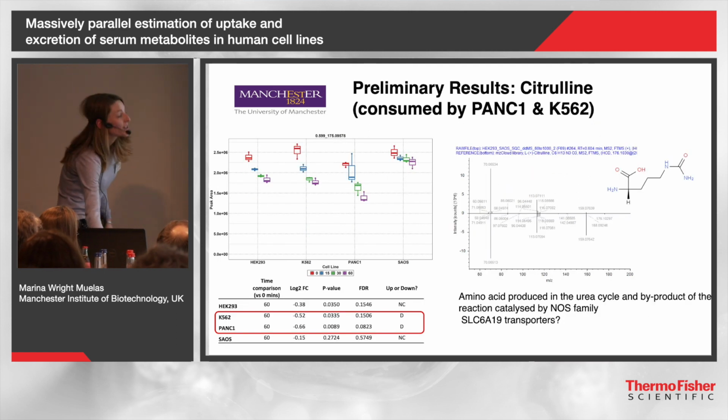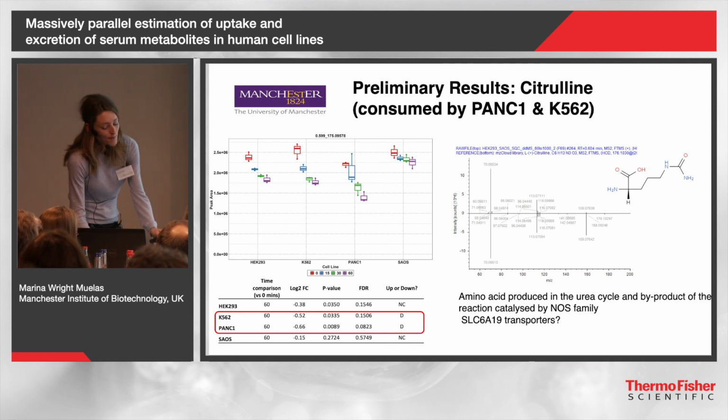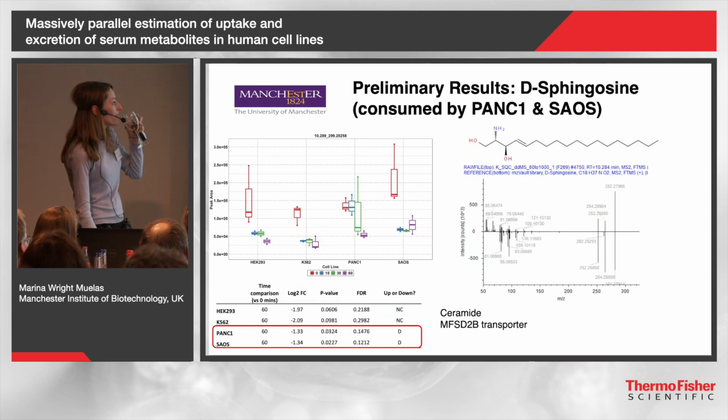And then, yeah, just citrulline. Again, 2 cell lines consumed this, 2 didn't. And sphingosine.